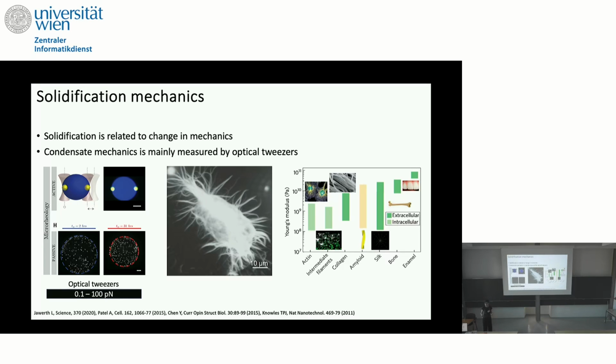Not only that, during this conference we have heard it in talks, and I've also talked to people who tell me that they have problems getting the beads into their systems. So it would be very nice to have a methodology that allows us to measure condensate properties from liquid to solid, because obviously the whole field of pharmaceutics wants to develop drugs that target solidification and then see how the drugs counteract it. And then we thought, okay, let's look at what methodology is used to measure the amyloid fibrils and take it from there, and go back and measure the mechanics of liquid condensates with that method.